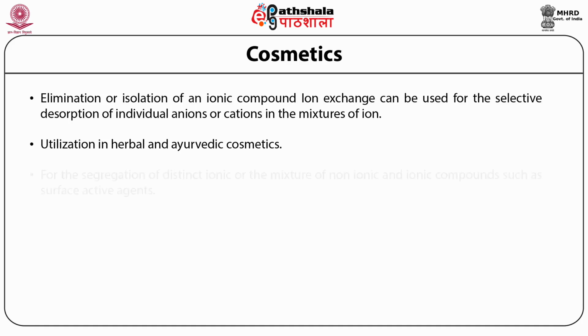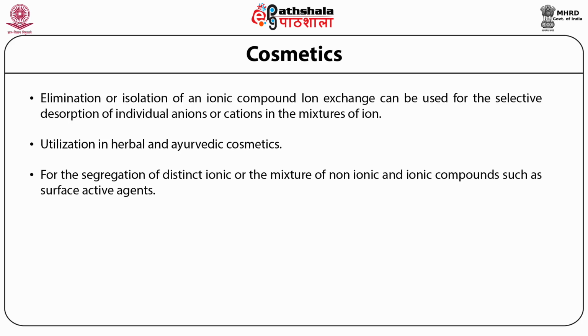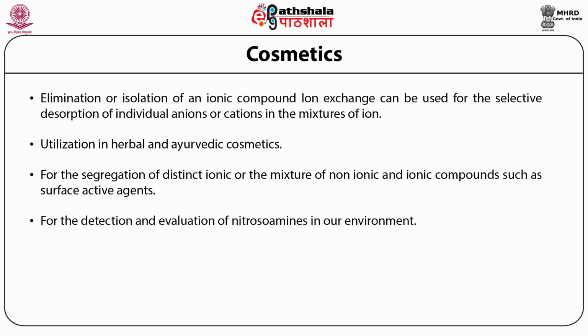IEC has been used for the segregation of distinct ionic compounds or mixtures of non-ionic and ionic compounds such as surface active agents. It is a highly sensitive technique for the detection and evaluation of nitrosamines in our environment. NDELA in cosmetics is an impurity in samples of cosmetics. It is adsorbed by a strongly basic anion exchange resin. IEC facilitates the cleanup process of cosmetics by recovery of various other compounds utilized in formulations of cosmetics.